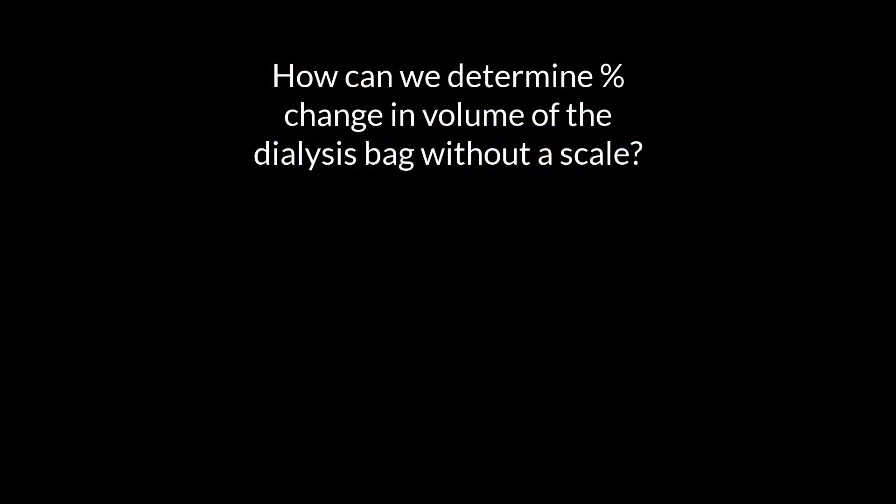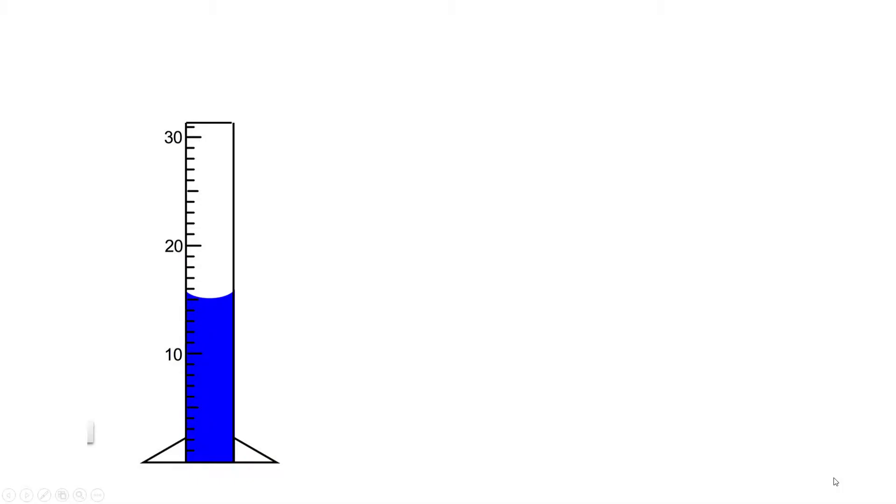Next we need to determine the volume in the dialysis bag but we don't have a scale which is what we would typically use. Instead we're going to make use of our graduated cylinder to measure the displacement as a way to determine volume.